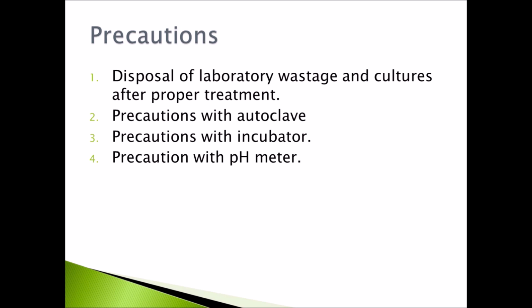Untreated laboratory wastage and cultures should be disposed of after proper treatment. The treatment is necessary for two reasons. Number one, if it contains pathogenic microorganisms, the disease may transmit to healthy persons. And secondly, it may contaminate soil and water, causing water pollution.